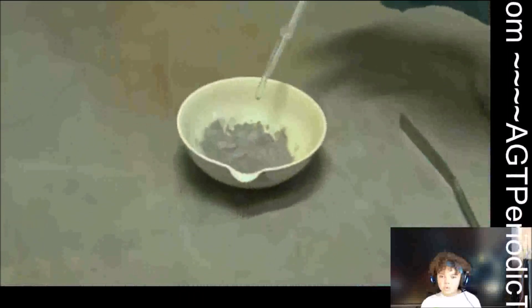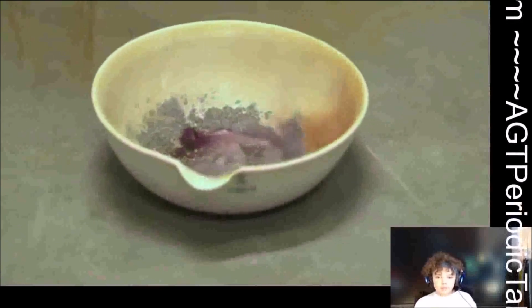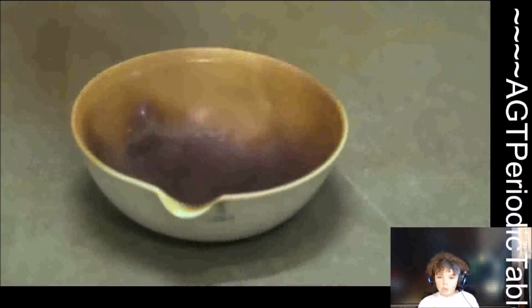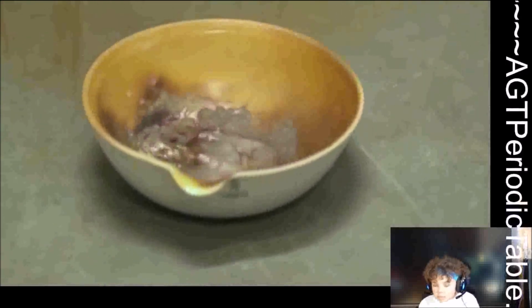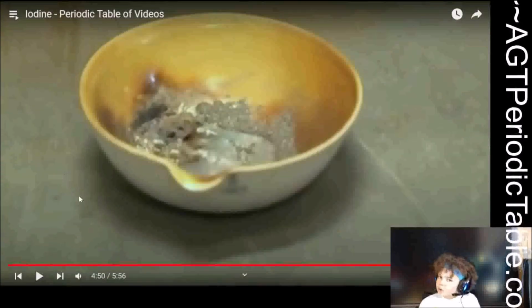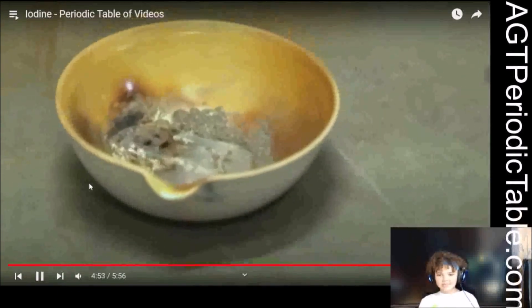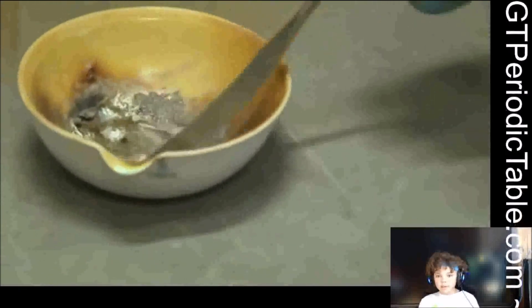Water, just take a small amount and add it to the reaction. Drop. So you can see it's starting to go now, the chemical reaction, because we're seeing the excess iodine subliming and forming a vapour. Now if we go in close, we can hear it fizzing, because this is actually the oxidation reaction and the formation of the new aluminium triiodide. I can't hear the fizz. I'm trying to listen. I can't hear it. Now, I'm going to just mix this slightly to try and increase the rate of the chemical reaction slightly.